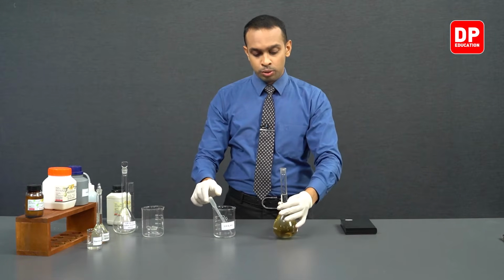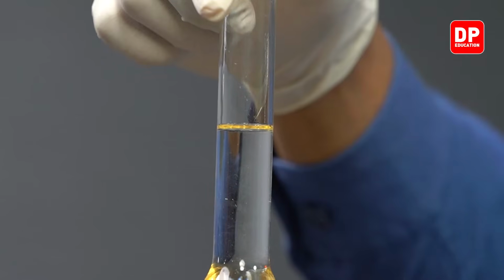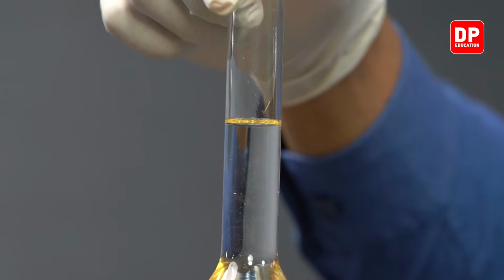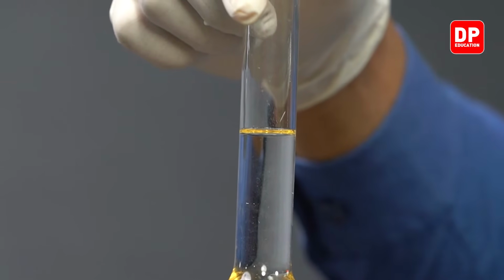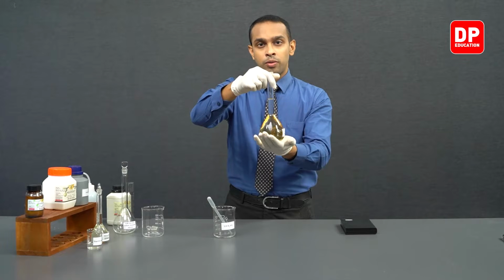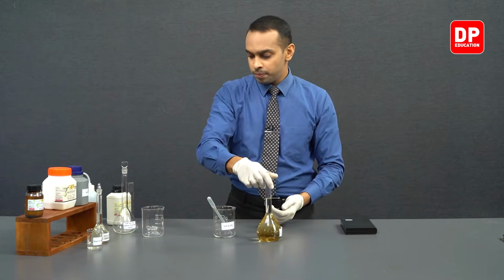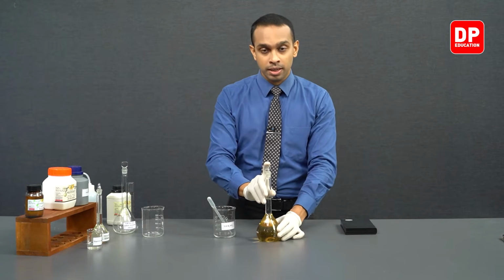And as soon as the bottom of the meniscus aligns perfectly with the calibration mark, you can stop adding sulfuric acid, and we have now prepared our 0.1 moles per decimeter cubed acidified ammonium ferric sulfate.